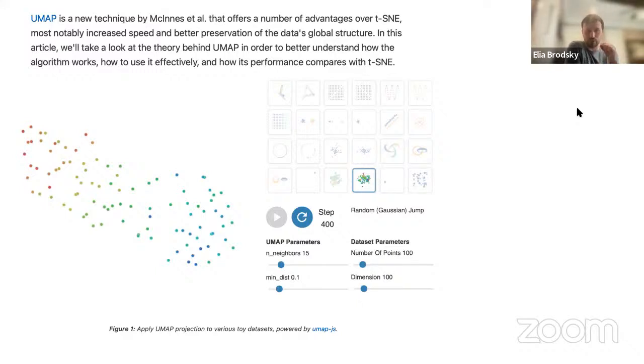Okay, more questions. What are some of the parameters that we can extract from t-SNE or UMAP separately? From what I understand, it's better to run them both. Exactly, yes, I would agree with that assessment. You want to run them both. You want to compare and contrast multiple methods and then select something that fits with your controls. Maybe go through several steps of transformation. And that is really why it is useful to have something easy to run, as opposed to being stuck dealing with the complexity of running everything independently, which we'll do today together. But I think it's still beneficial to try to understand and then be able to compare and contrast.